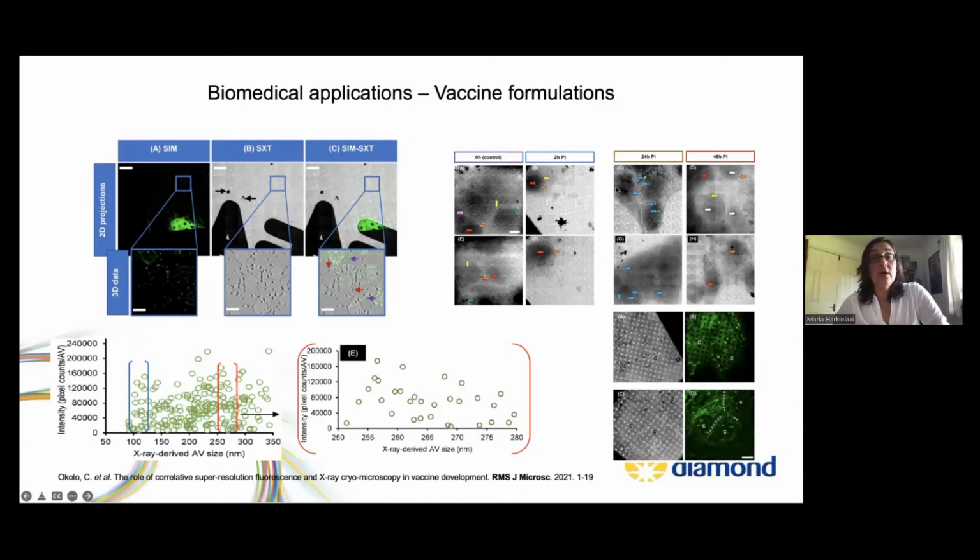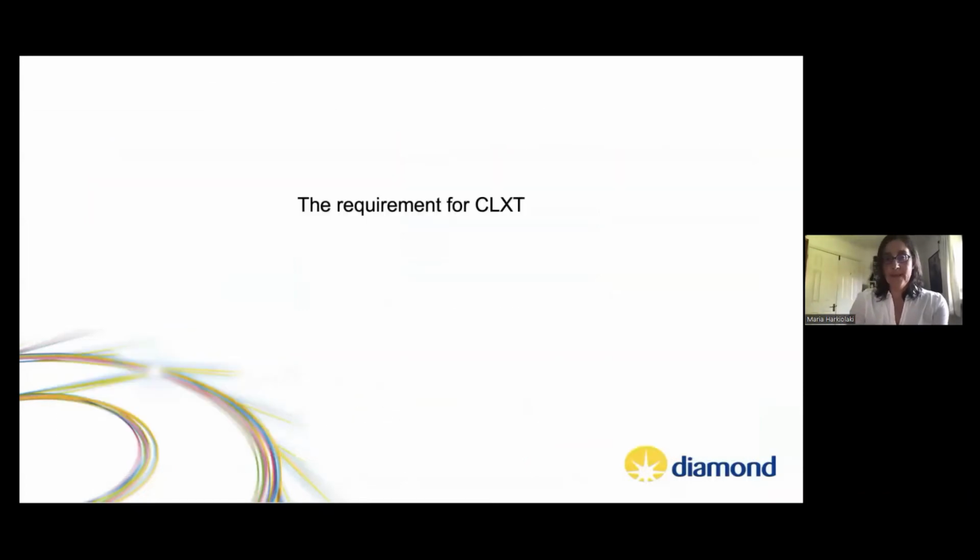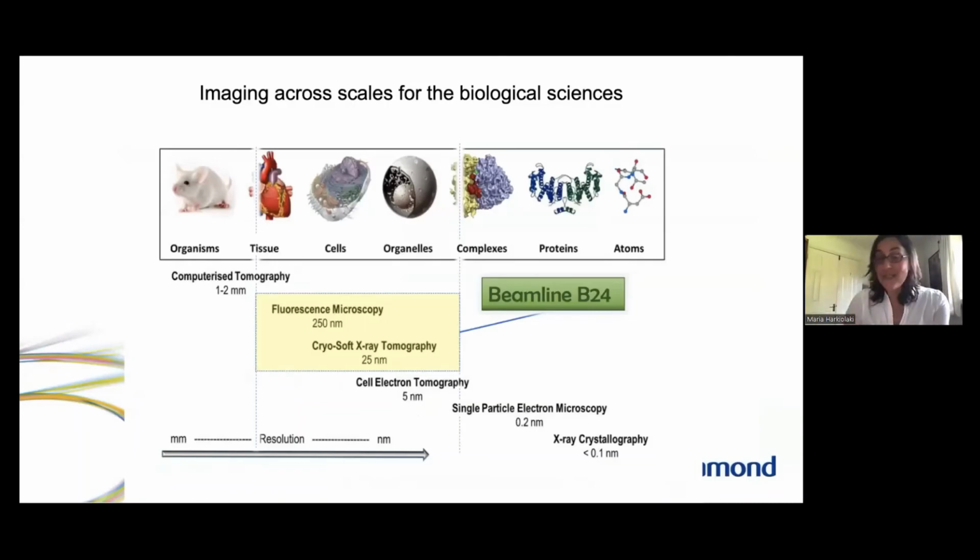Because after 2 hours, we knew that after a day, the cells really struggled to recover, but within 2 days, they had recovered. Cell cultures can be a very sensitive indicator if something is toxic or not. So that was very encouraging that they were able to recover. Not only that, but after a few days, we were able to show secondary expression and confirm what the company was proposing, that the cells were able to accumulate the DNA, the plasmids they were providing, and actually start producing their own antigens.